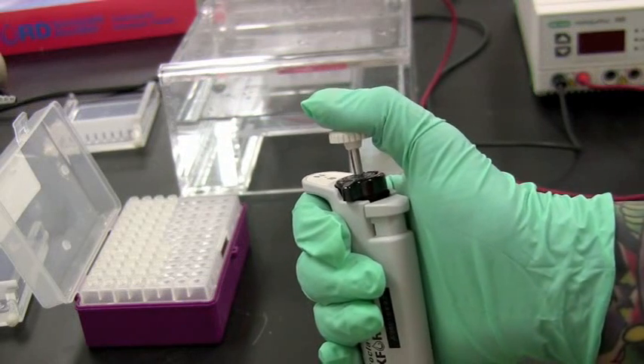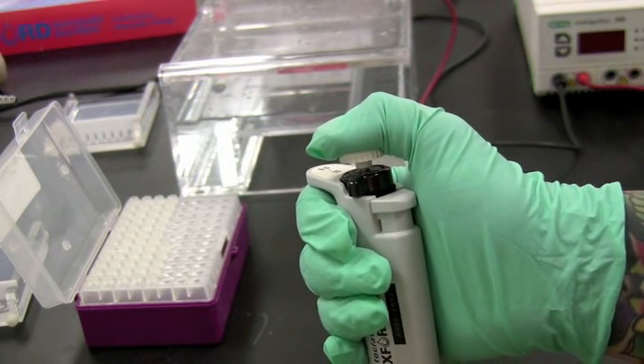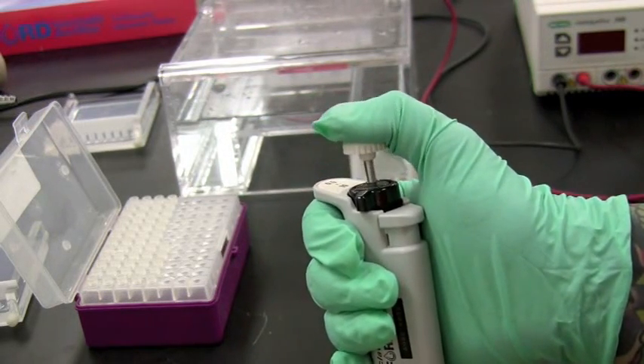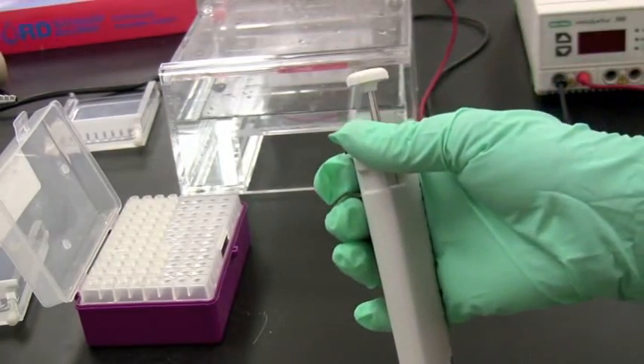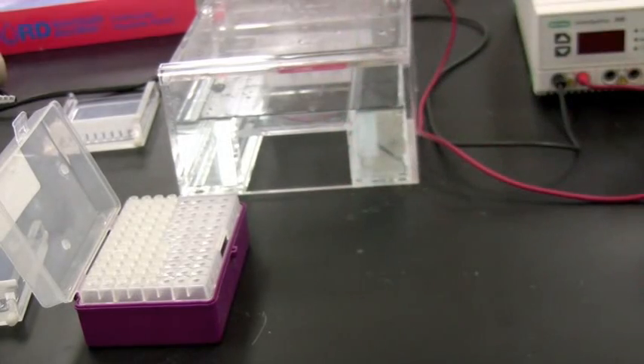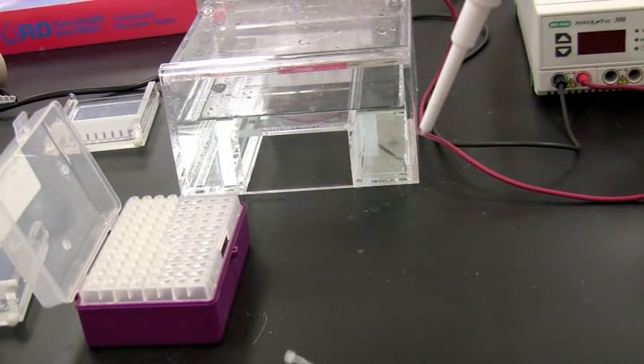To extract liquid with the pipette, press until a first stop is felt and then release. To expel the liquid, press all the way past this first stop. To release the tip, press the button on the side and the tip will be ejected.